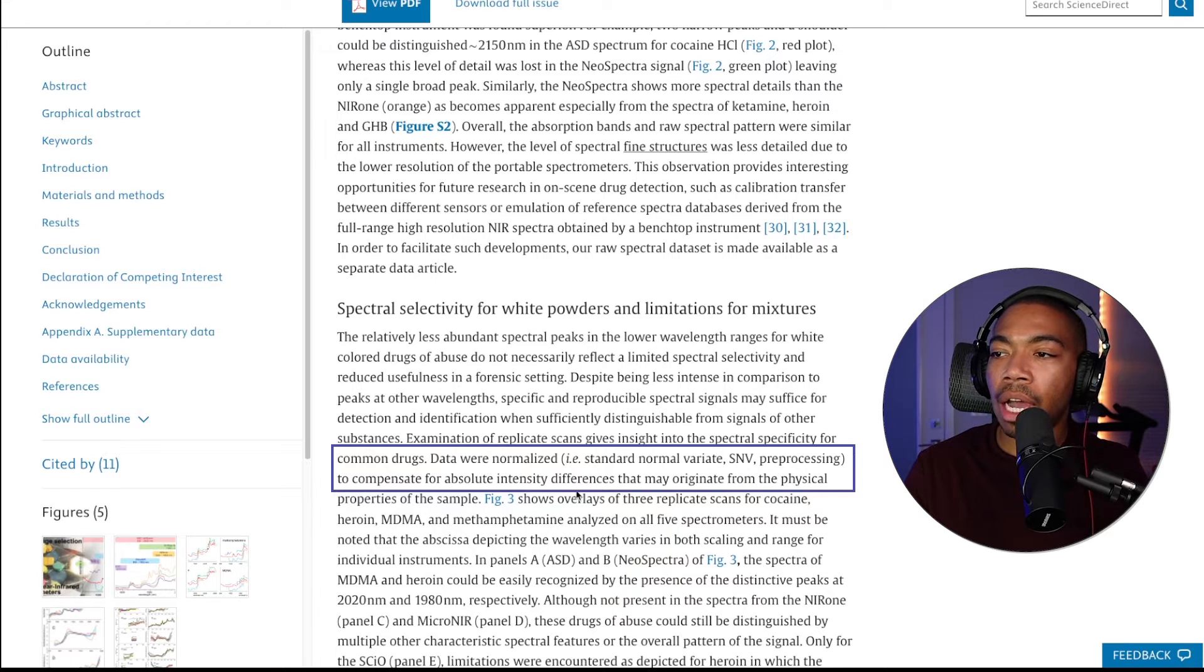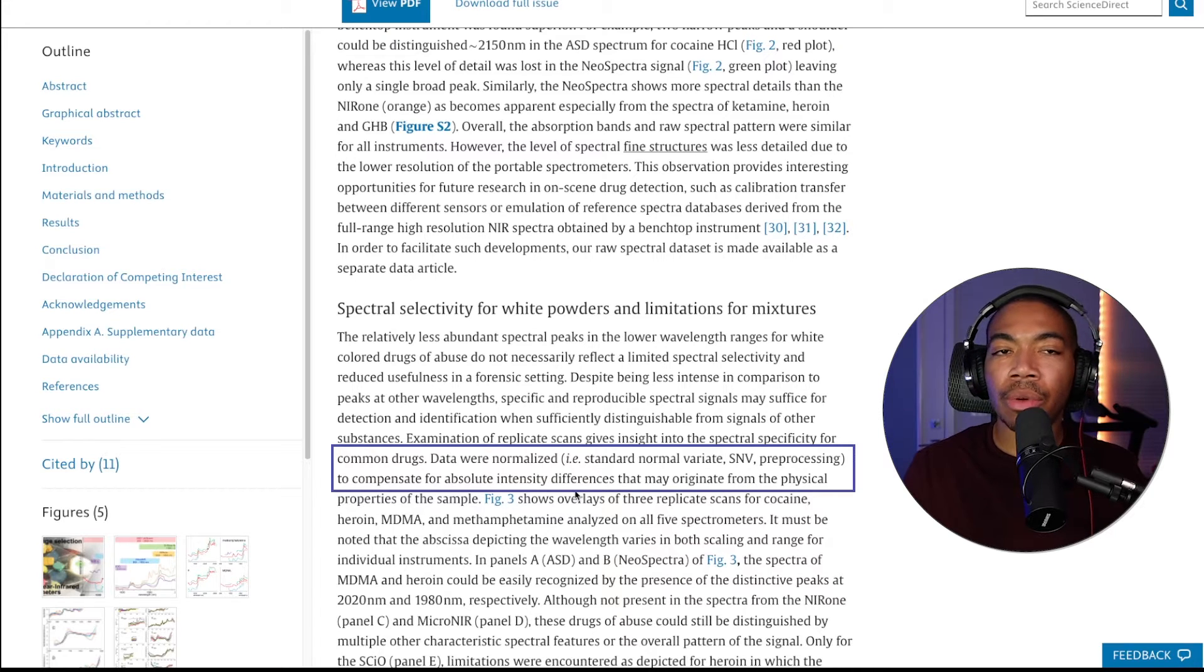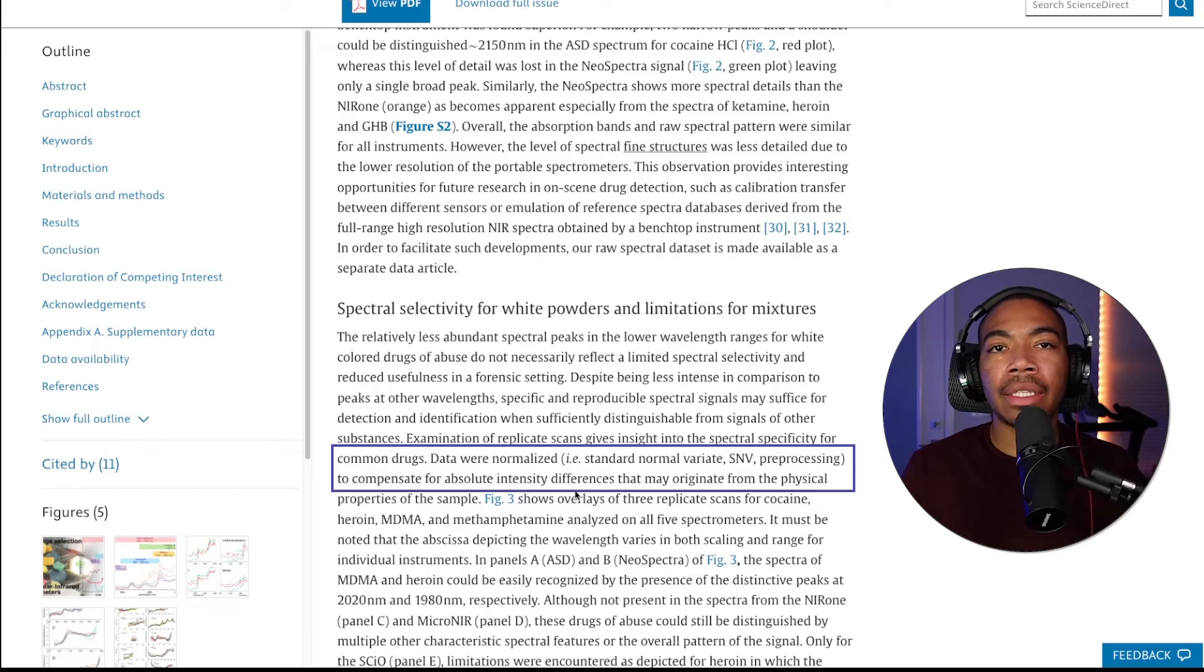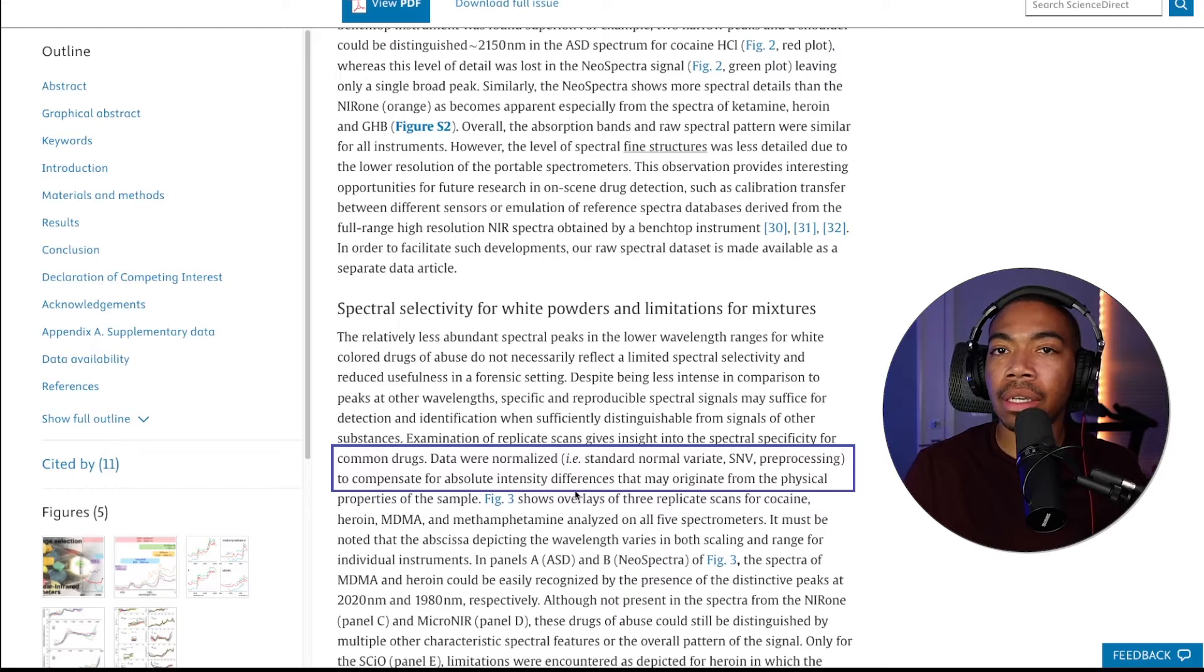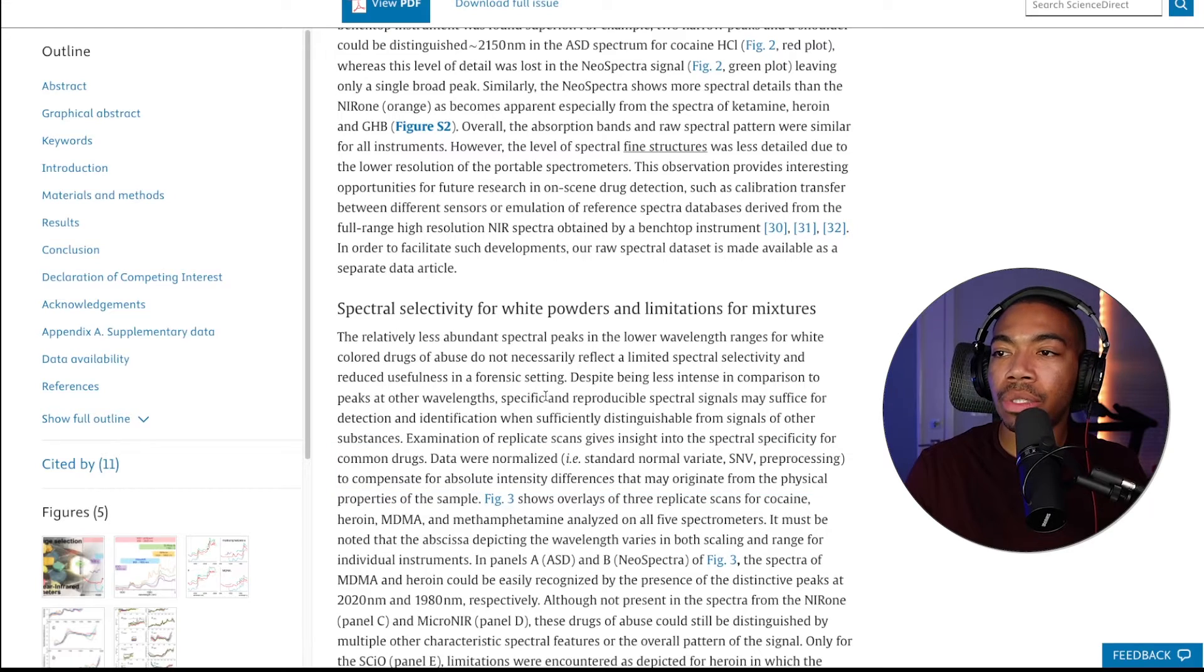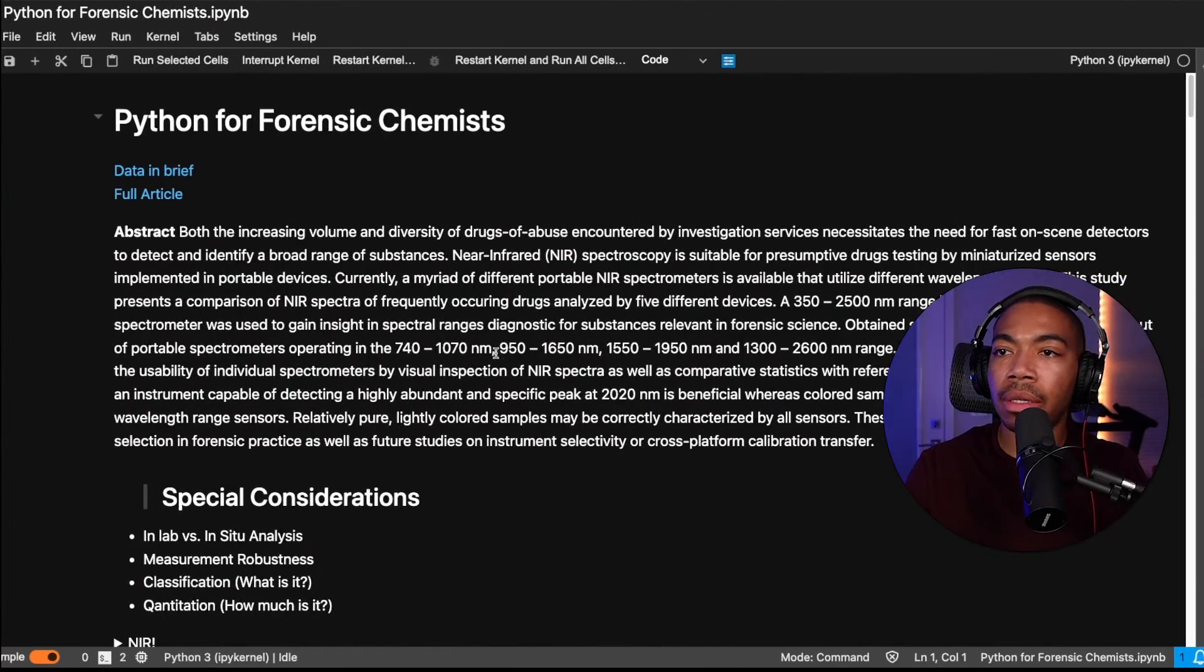And so I want to demonstrate what this looks like, why we do it, as this is a vital preprocessing step, especially key for spectroscopic analysis. And so let's switch to the notebook and we'll get started.